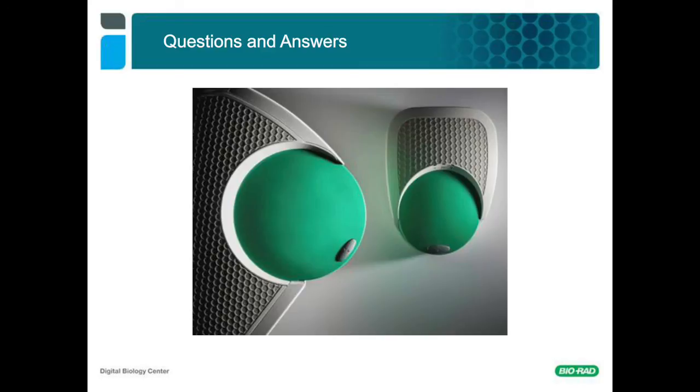Thank you for that. So in your presentation, it also appears that the fragmentation rate for the CFTR locus is linear, whereas the fragmentation rate for the mile marker locus is exponential. How do you explain this? Yes, we were very perplexed by this at first glance because it definitely seems contradictory. And to make sure that we weren't missing anything, what we did is we went back to a CFTR cell line, we grew it up, and we did a mile marker study in the cell line.